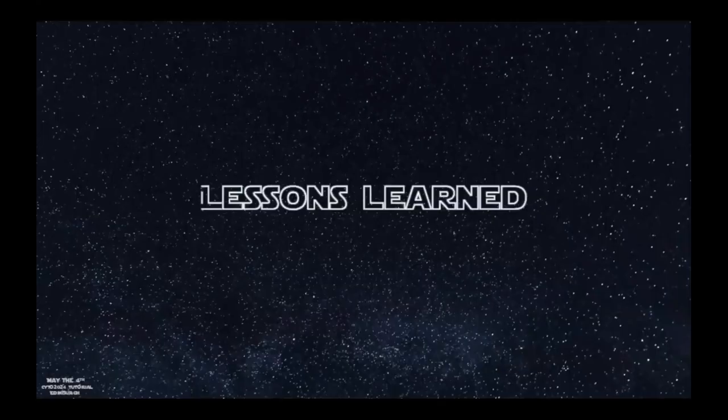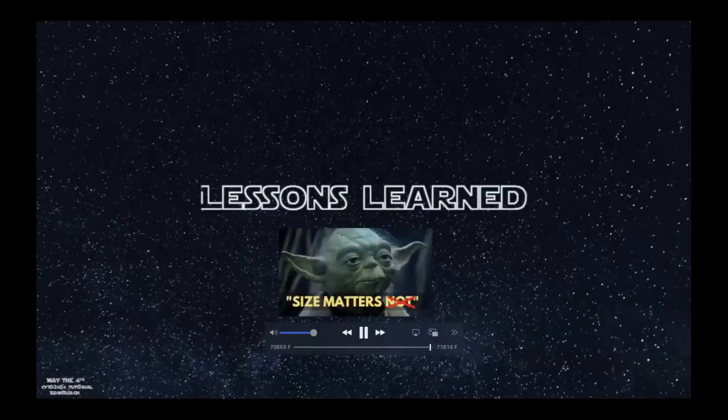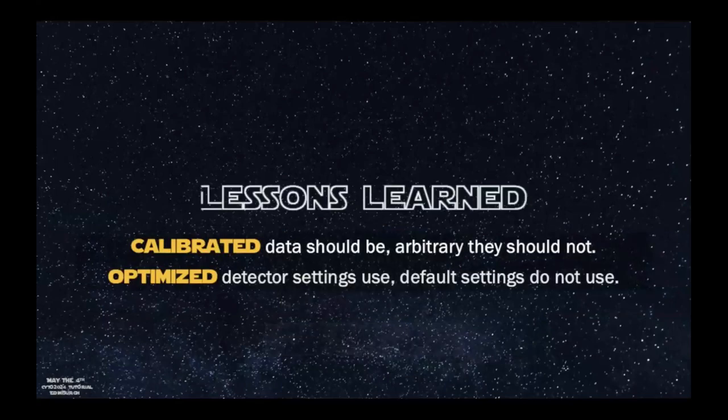And last but not least, we'd like to wrap up with the lessons learned. Size matters not. Size does matter. So lessons learned here: calibrated data should be used, arbitrary units should not. Optimized detector settings use, default settings do not use.